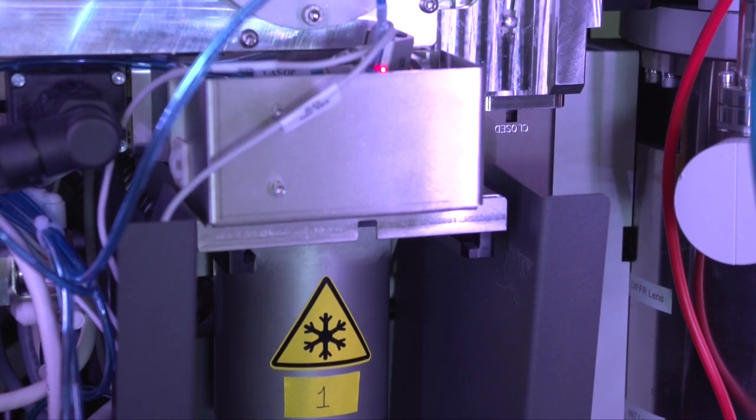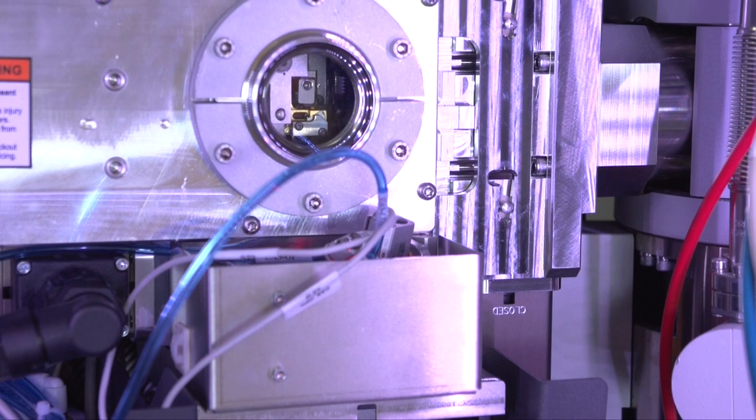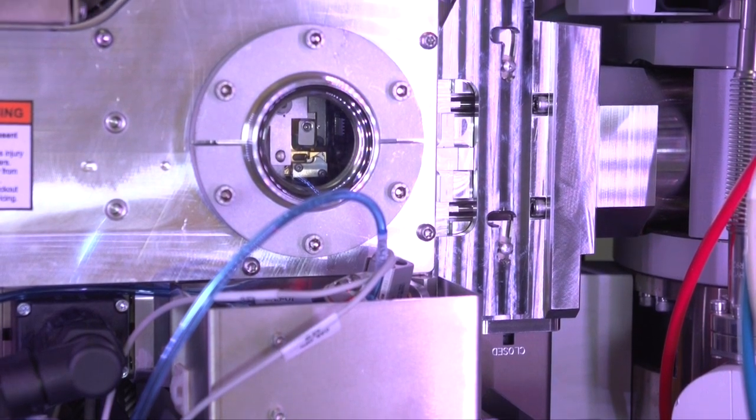Powerful computers are used to automatically combine molecular images and calculate an electron density map of the complex of interest.